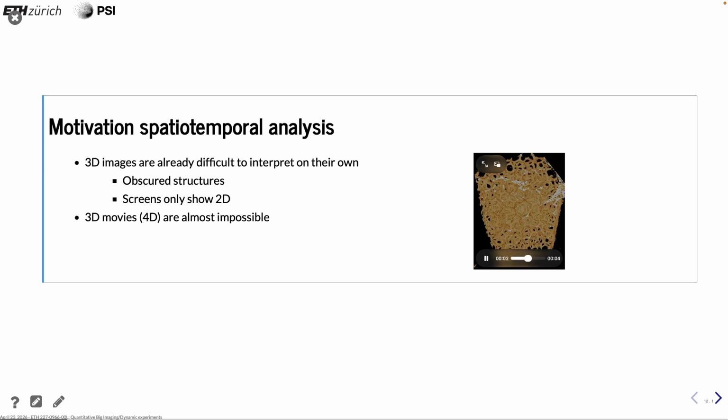So that is also a design question and what the data actually requires. In some cases, you can do step-by-step 3D. Other cases, you have to do the full 4D. Some cases you can maybe, if you're really lucky, even do 2D, but that's more questionable.